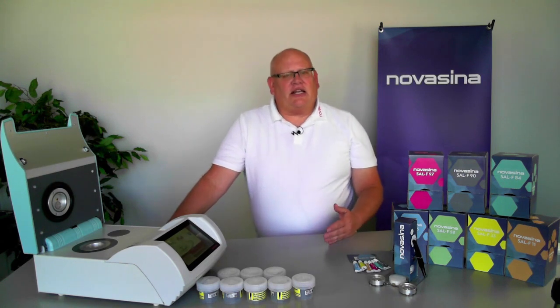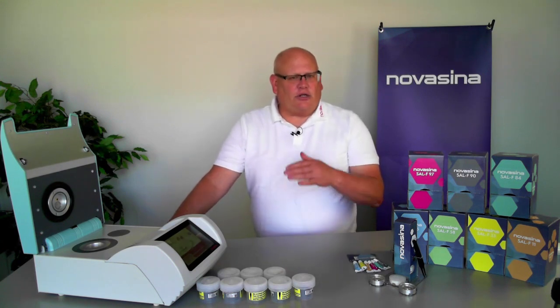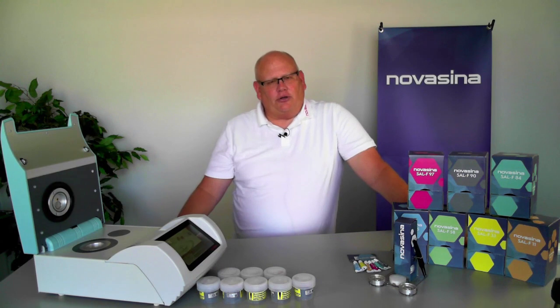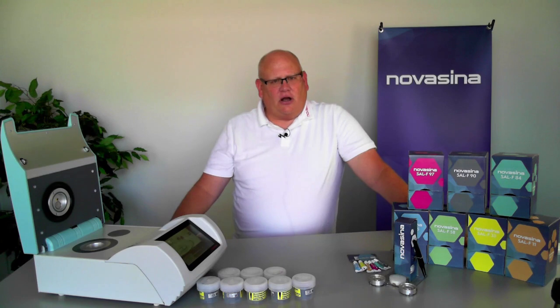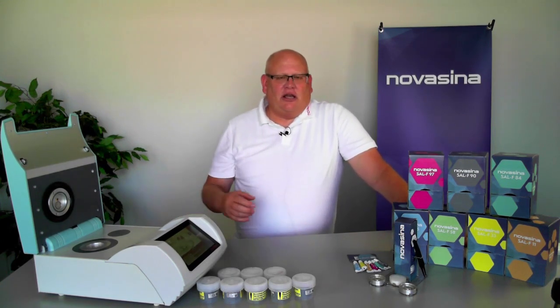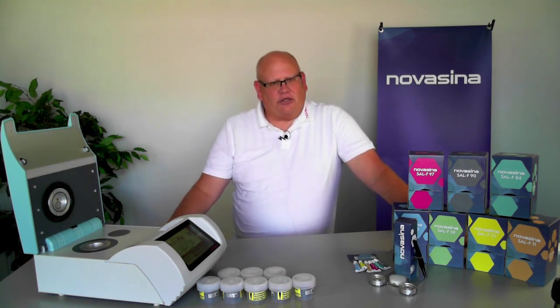It's important to distinguish between verification and calibration. Verification means just checking the instrument to see if it's reading within tolerance, and that's what's typically required. You only need to do a calibration — which means actually adjusting or shifting the numbers being produced by the instrument — if the verification doesn't read within the accepted tolerance limits. The system allows you to choose verification as opposed to calibration, and if verification is within tolerance you proceed; if not, it gives you the option to perform a calibration.